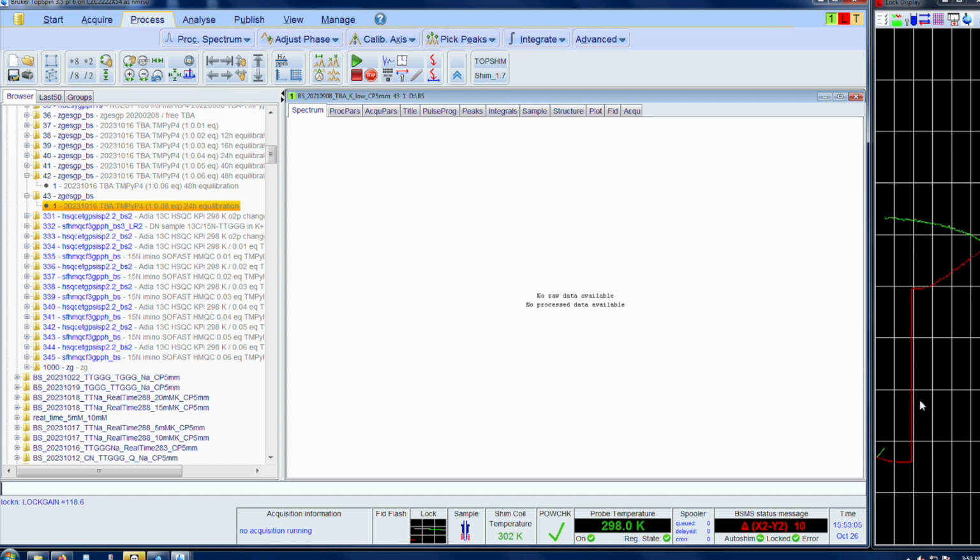And what it's trying to do is to see what is the area under the curve for the deuterium FID, and therefore keep it at the frequency of deuterium. Basically, keep it at the D2O frequency. That is the first step that is being done. So that's how lock works.